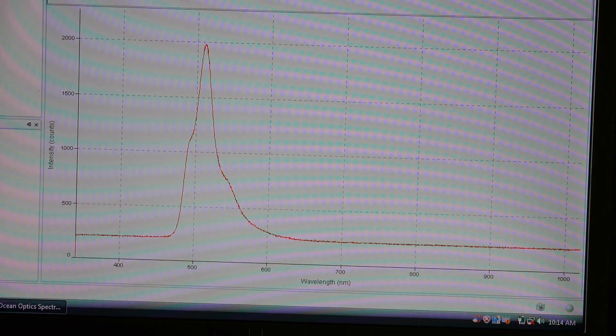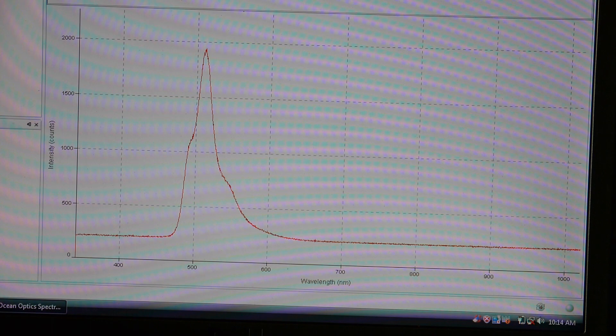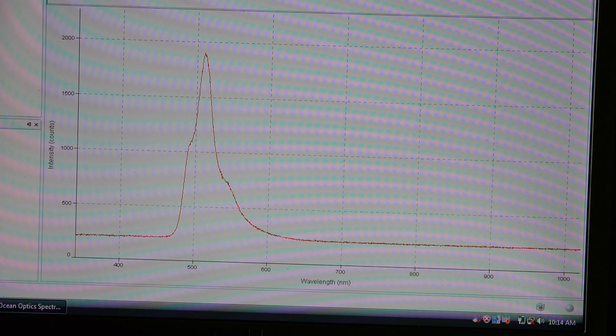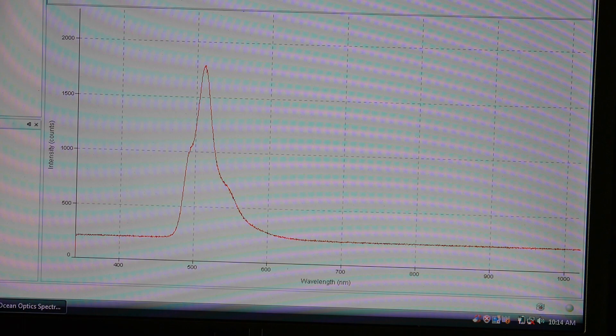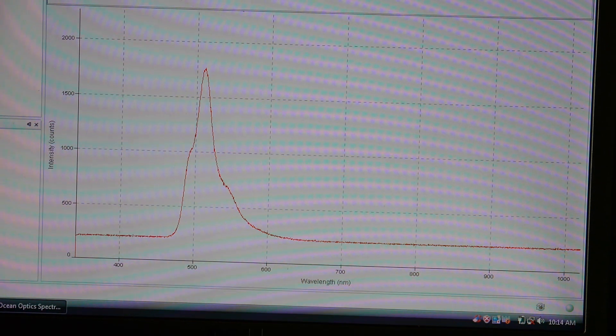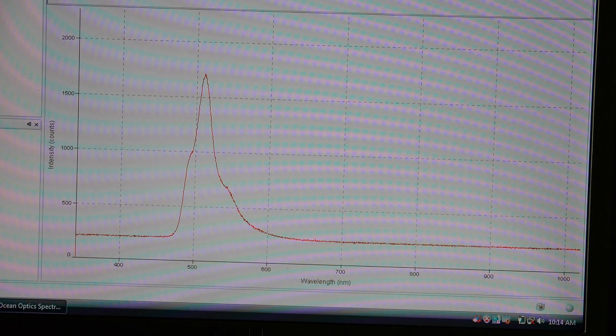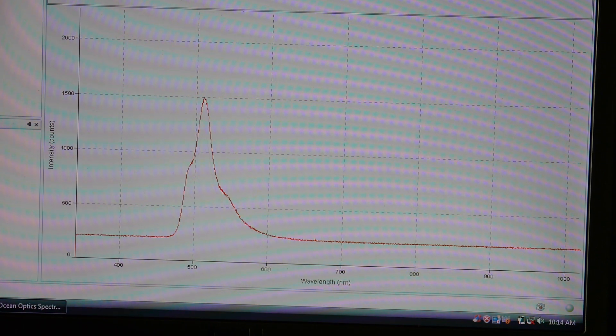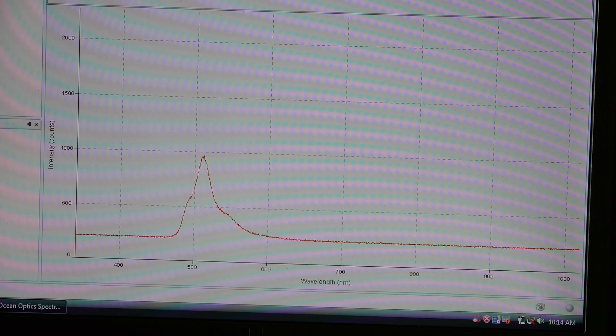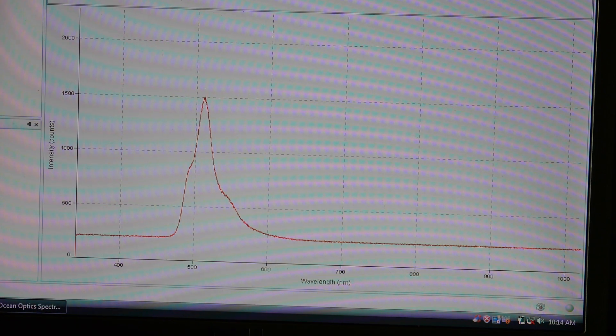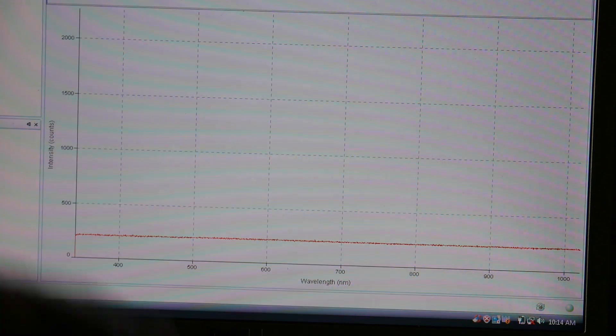So it's peaking out at about 510, 515, something like that. And very narrow. Seems a little bit narrower than the others. So certainly a lot brighter than the others. So that's the green one.